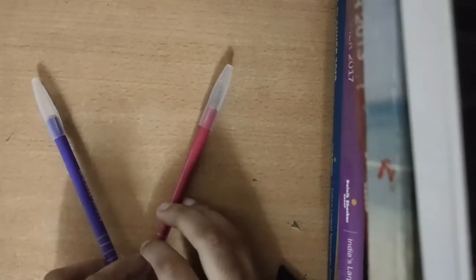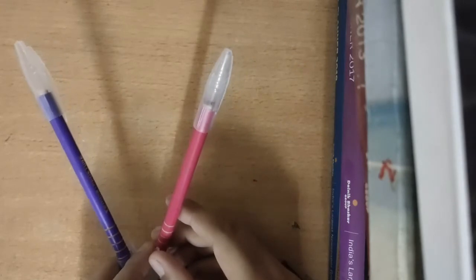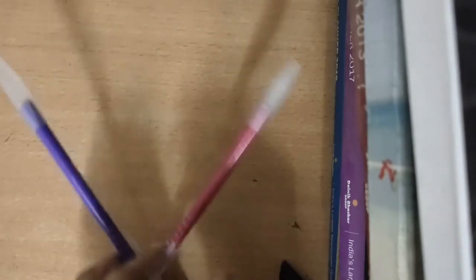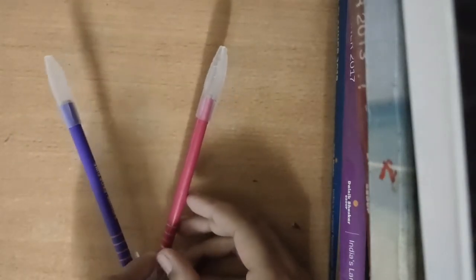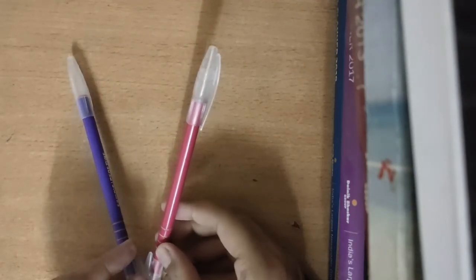Now wagging. In wagging, the plane will change, but both the molecules will move in the same plane like this. And in twisting, the plane will change, but the molecules will move in different planes like this.